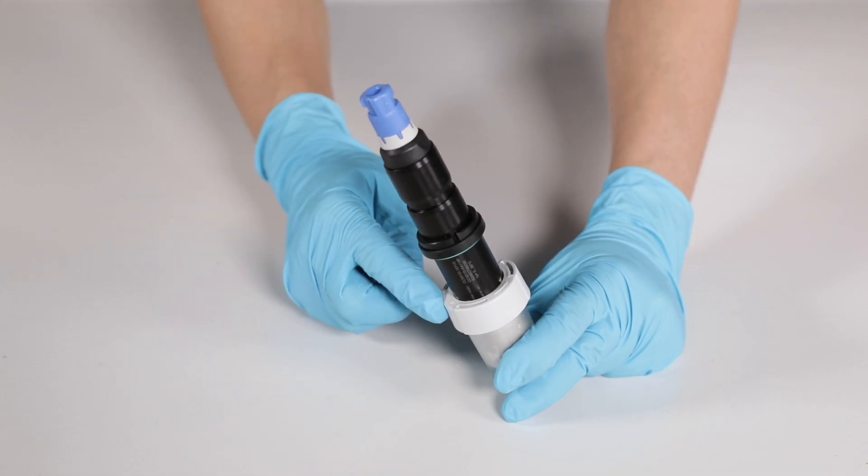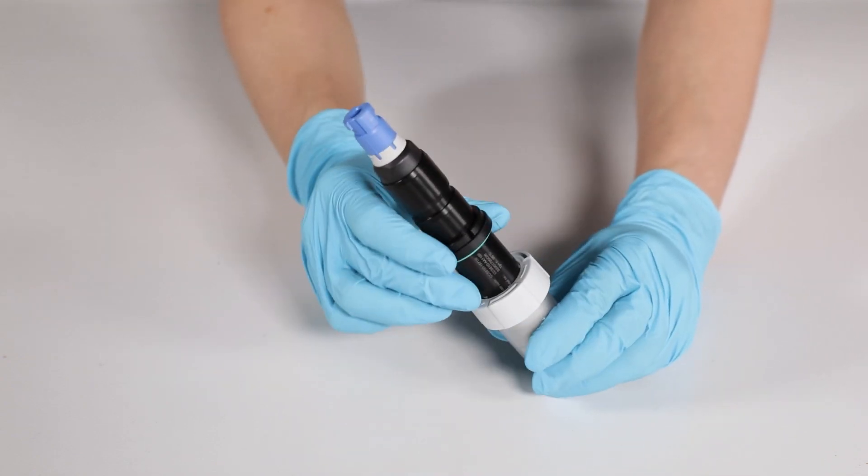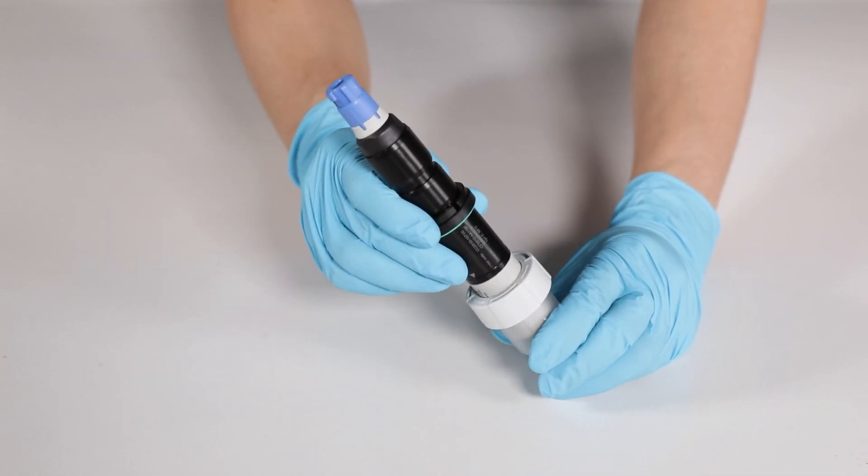First open the top part of the protection cap by turning it counterclockwise. After that carefully remove the protection cap from the sensor. Don't remove the sensor from the protection cap without opening the top part first. This could damage the sensor membrane.